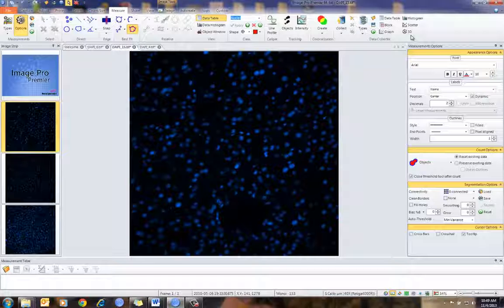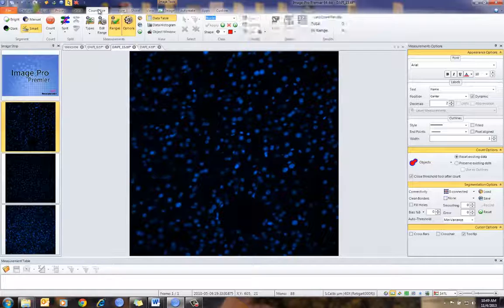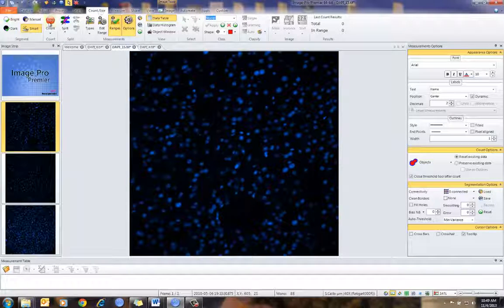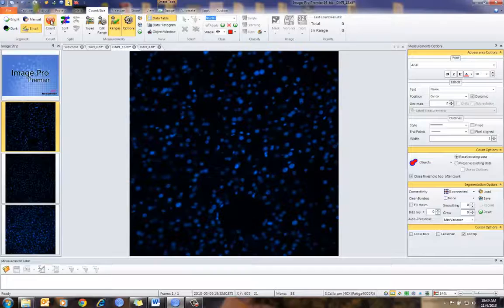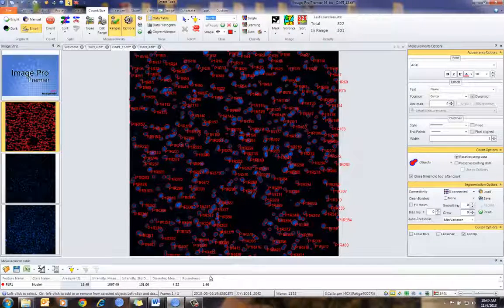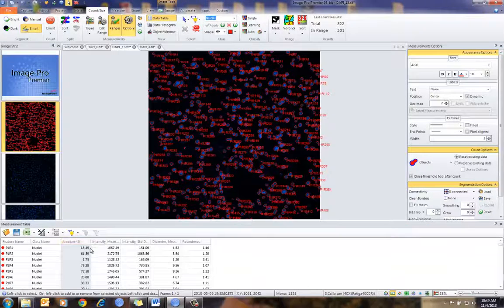All right, so let's go through and get this set up. I'm going to go to one of my images. As I mentioned, I already had this set up in Count Size. I'm using smart segmentation to count my nuclei, and I'm going to simply count. As you can see, I've counted my data, and I have my data here under my measurements table.